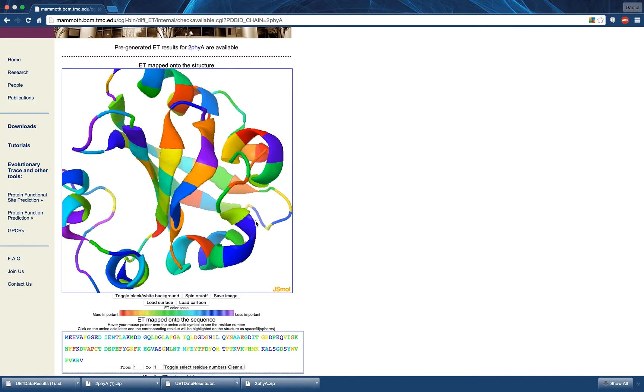You can also hover over a residue in order to see an informational bubble about it. Finally, by right-clicking inside the structure viewer, you will reveal the JSmol menu, which can be used to access more advanced functionality not covered in this video.